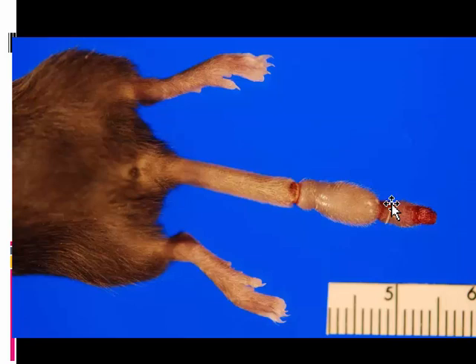So this is a cornification defect. It's been identified as causing disease in some types of mice with these lesions. The other issue that might conceivably cause that is bedding. Some people want to use comfortable cottony bedding, and threads or pieces of bedding can get wound around the tail, especially of very young mice, and cause restrictive lesions. So that is something that probably also needs to be considered.